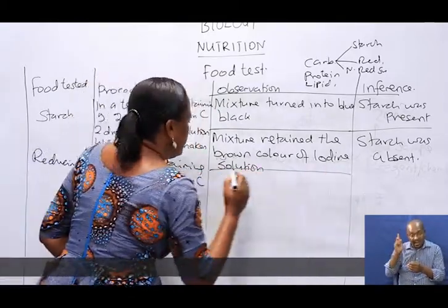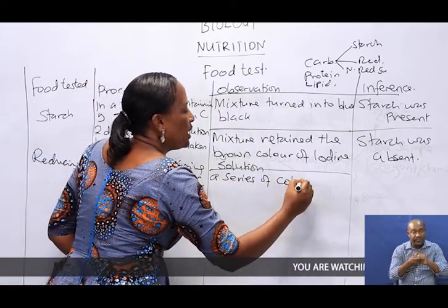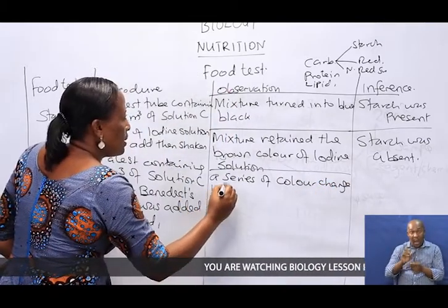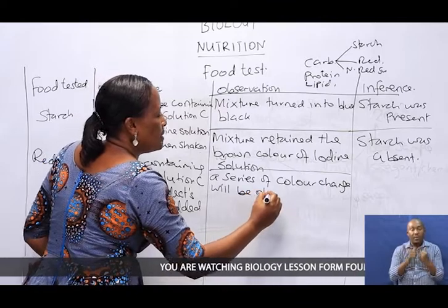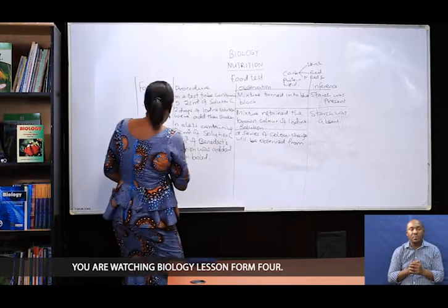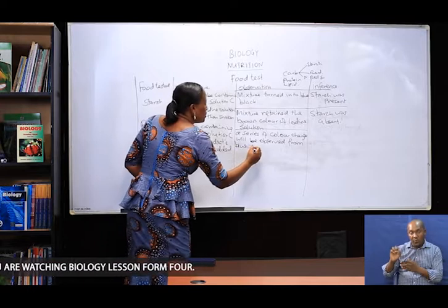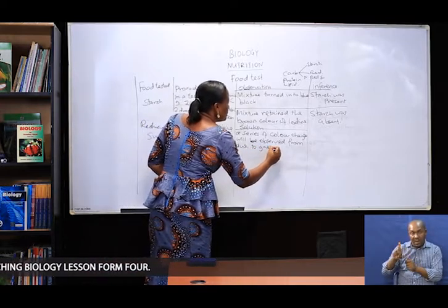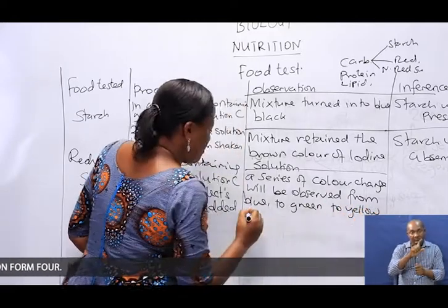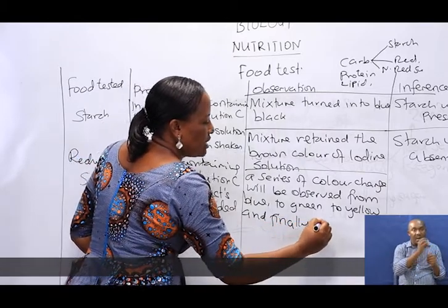A series of color changes will be observed, from blue to green to yellow, and finally orange.